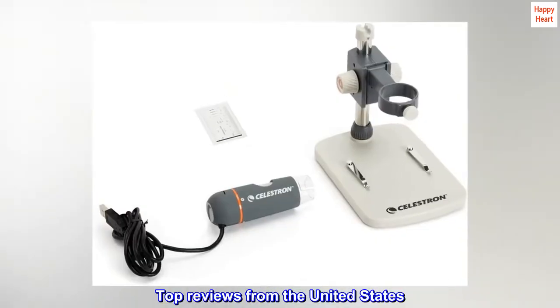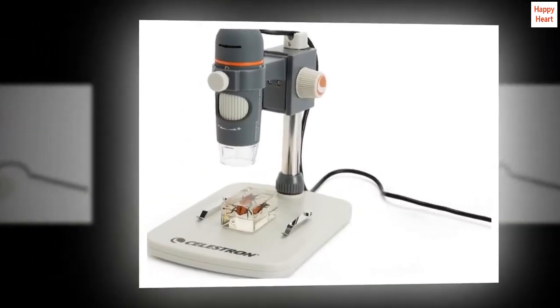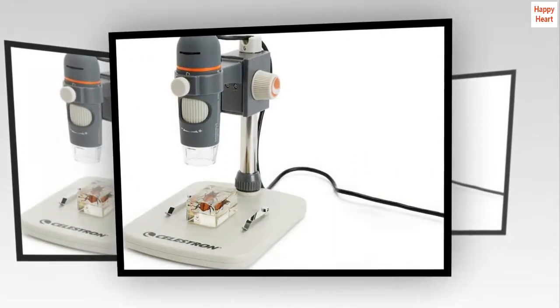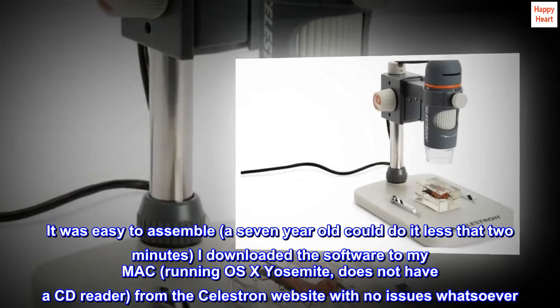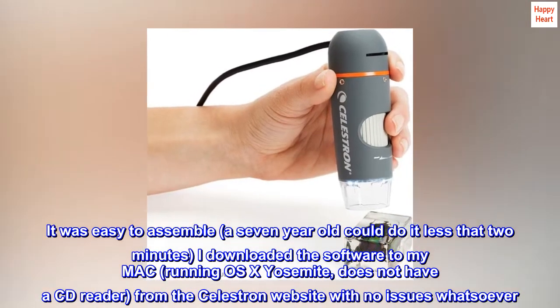Top reviews from the United States. It is exactly as advertised on Amazon. It was easy to assemble — a 7-year-old could do it in less than 2 minutes. I downloaded the software to my Mac running OS X Yosemite — it does not have a CD reader — from the Celestron website with no issues whatsoever.